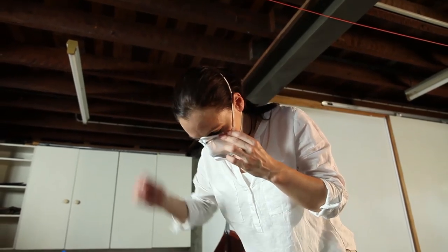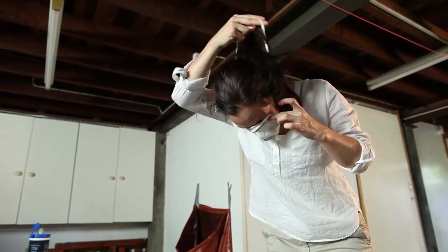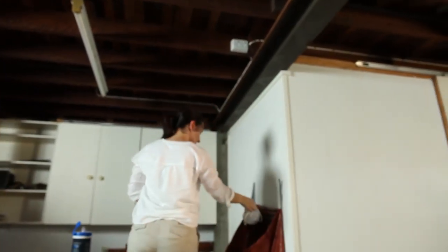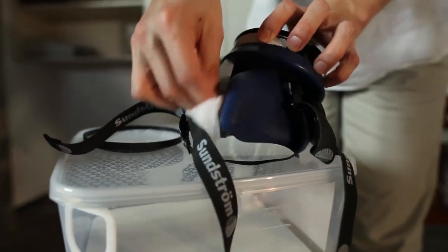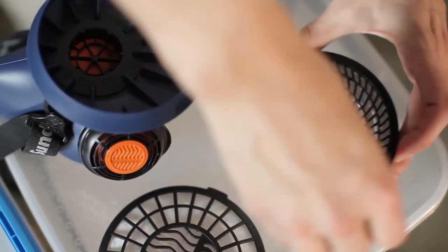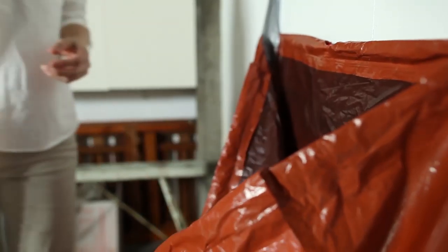Finally, remove your respirator. Removing your respirator last will protect you while removing all other PPE. Lean forward and remove it from your face by the straps, taking care not to touch the front. A disposable respirator should be disposed of into the waste bag, but a reusable respirator should be treated by separating the filter from the respirator, wiping the inside and outside surfaces of the respirator with wet wipes, wiping the filter with wet wipes and placing it and the respirator into separate storage containers, sealing both the containers to ensure they remain uncontaminated for their next use. A filter at the end of its life should be immediately disposed of.